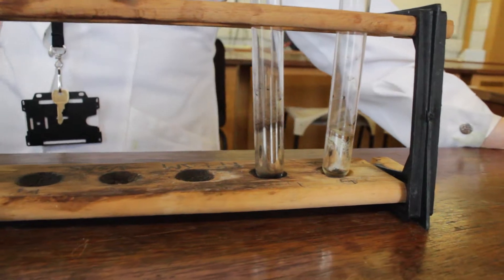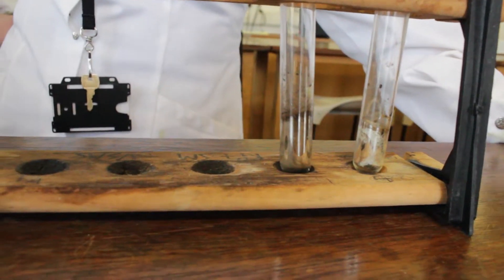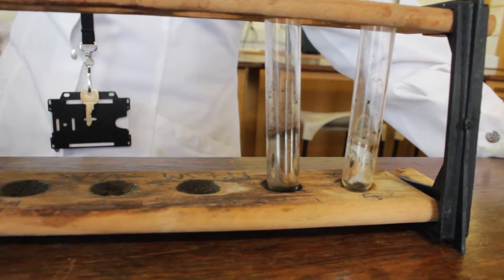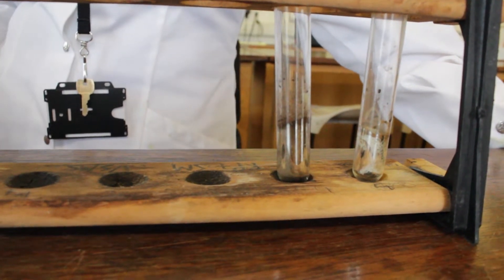The test we're doing today is the silver mirror test. It's a test that's used to distinguish between the two carbonyl compounds, either an aldehyde or a ketone.